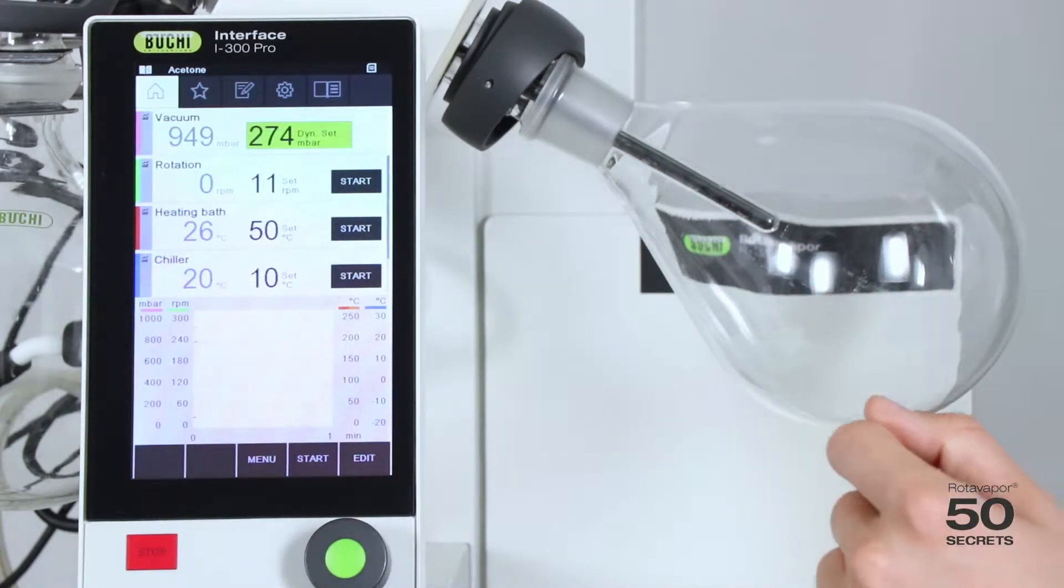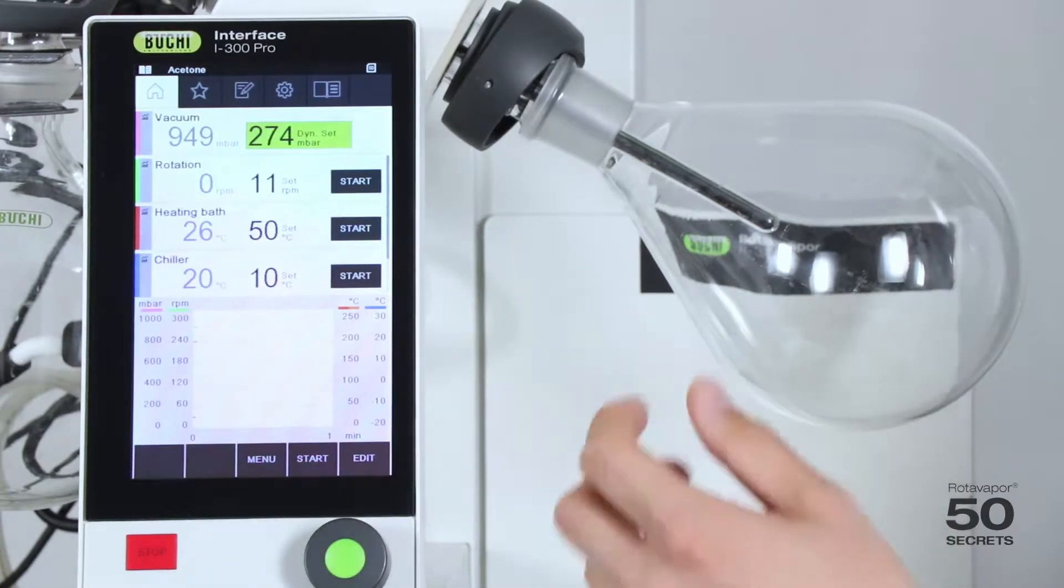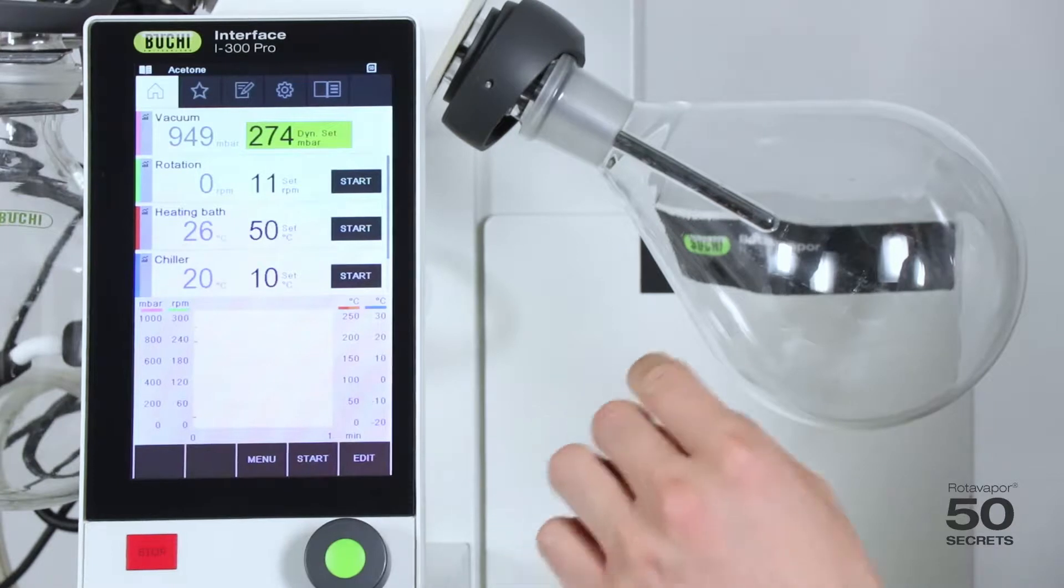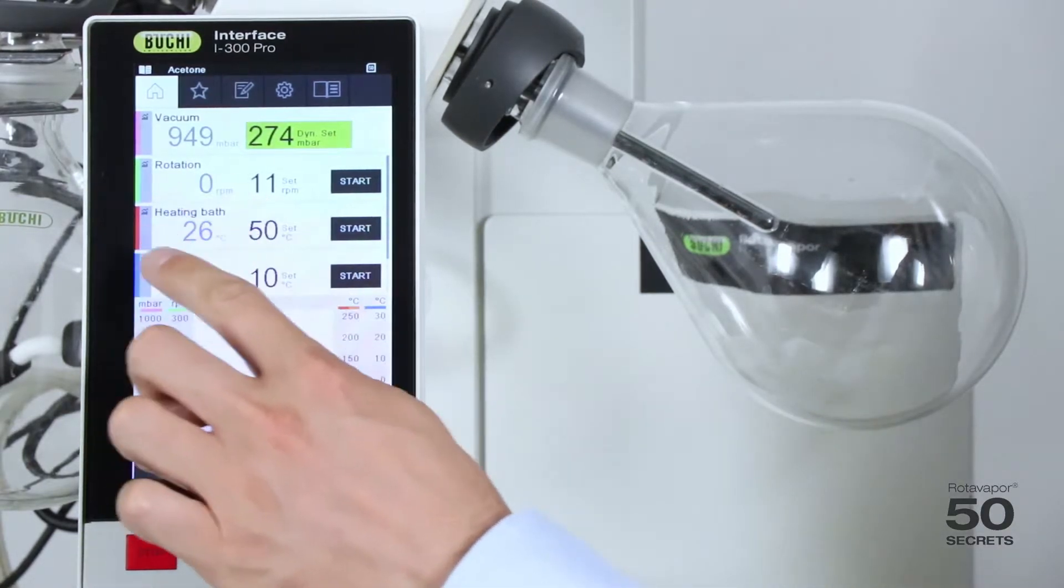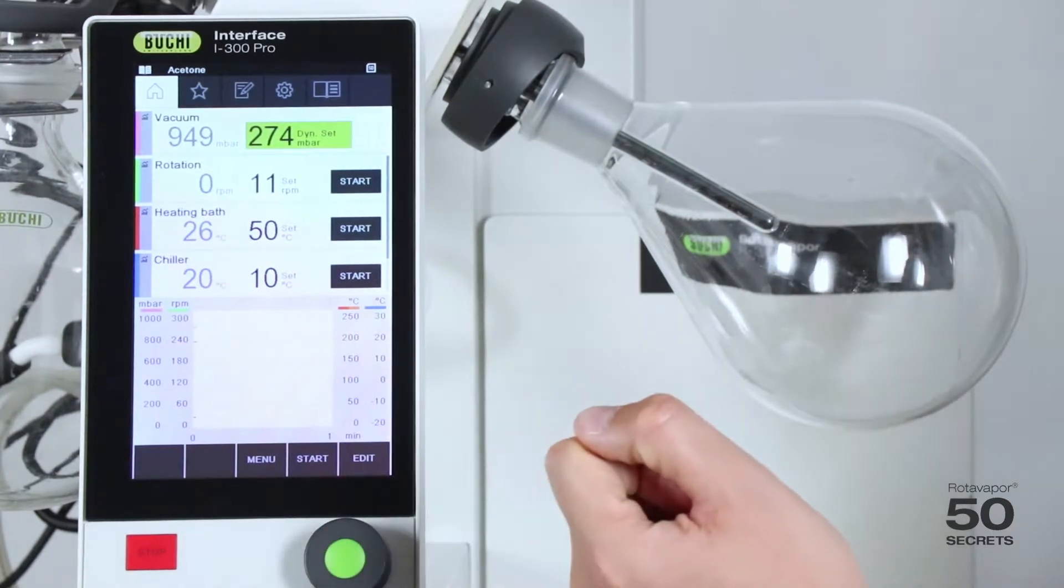Now what is that? That is actually a patented mechanism in order to start quicker with the distillation. Which means at the moment the heating bath is only at 26 degrees, and the chiller is at 20 because we are at room temperature.